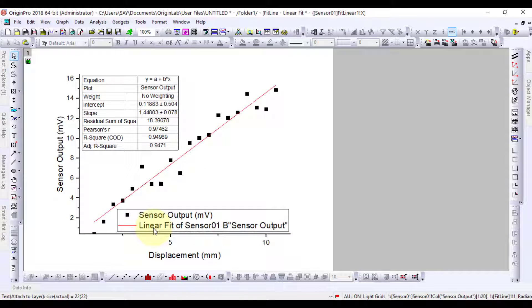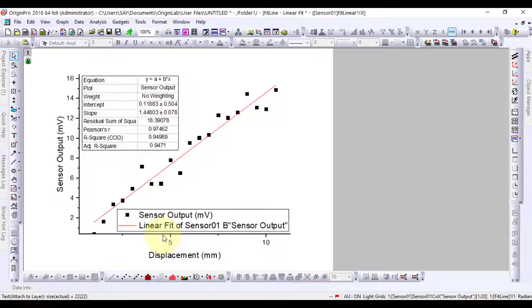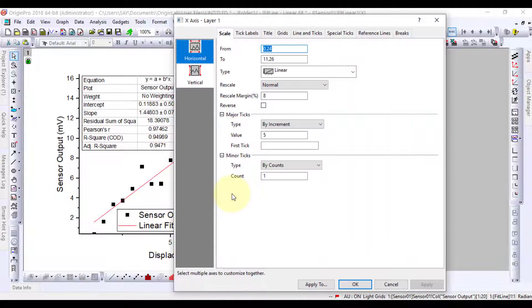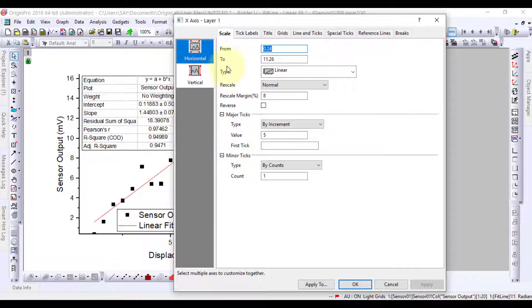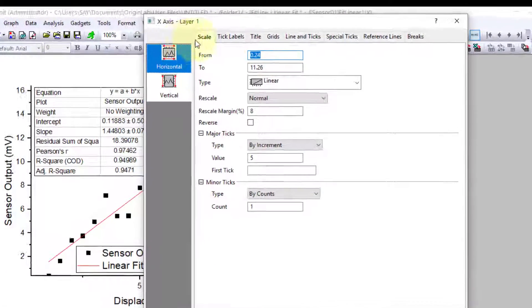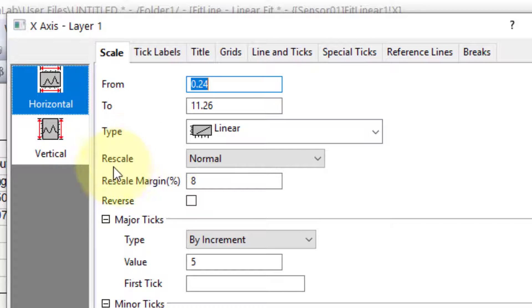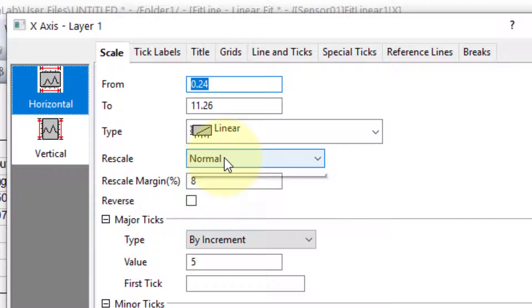Now, we will make changes to the plot so that the automatic calculations are done for the other data. Click on the X axis. On the Scale tab, change the rescale to auto.